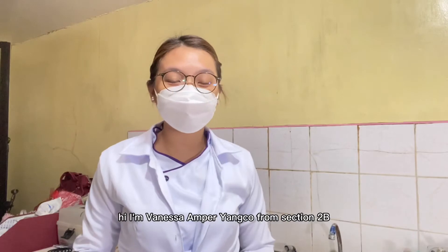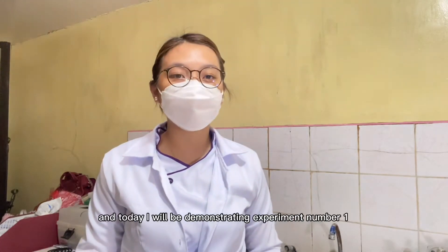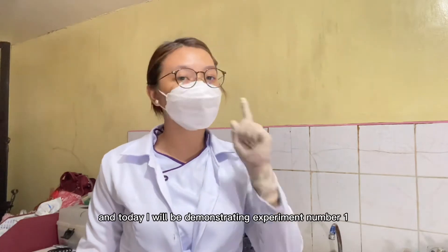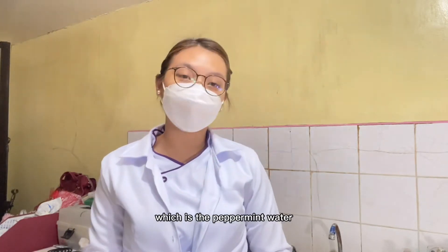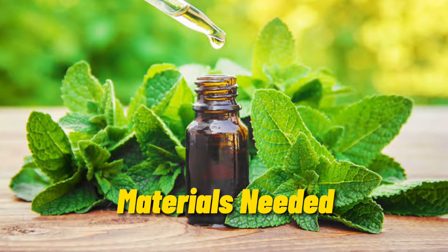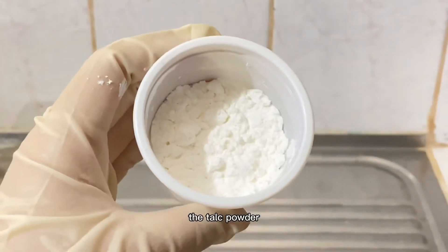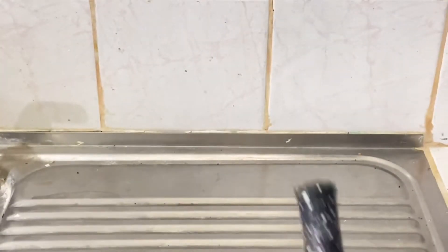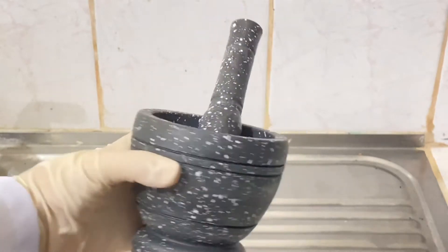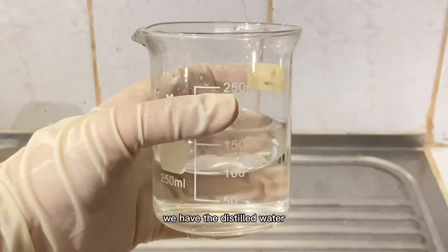Hi, I'm Vanessa Amperyanko from section 2B, and today I will be demonstrating experiment number one, which is the peppermint water. We have the peppermint oil, the talc powder, the mortar and pestle, and the distilled water.